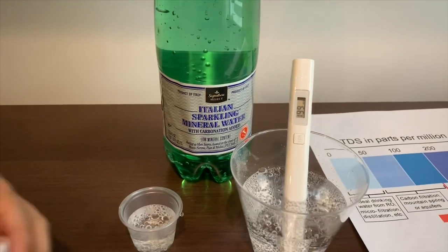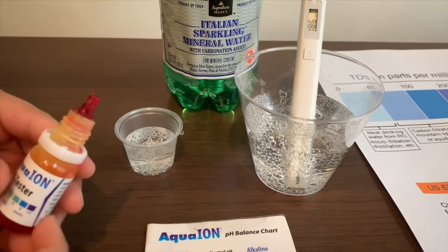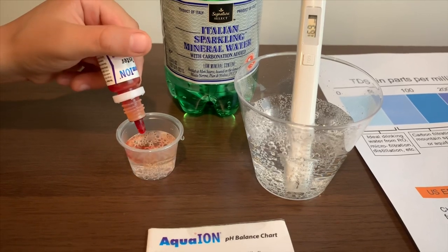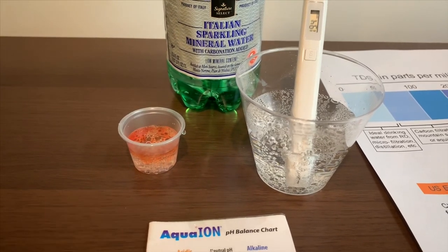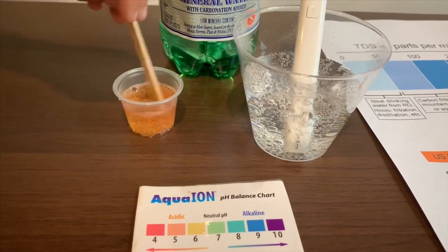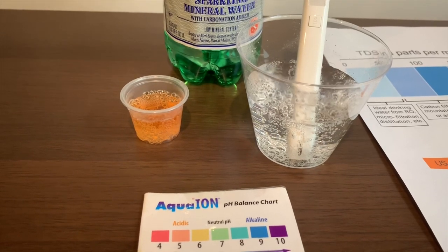Now let's test the pH level. If you want to buy this pH Tester, check the link down below. I'm going to do two drops. Let's stir it a little so we'll get a better result. I'm giving this a 5.5 — this is acidic.